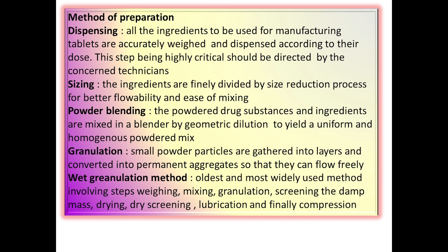First technique is wet granulation method, the oldest and most widely used method involving steps which include weighing, mixing, granulation, screening of damp mass, drying, dry screening, lubrication and finally compression. So first step is weighing. All the ingredients which are mentioned in the formula, they are weighed.